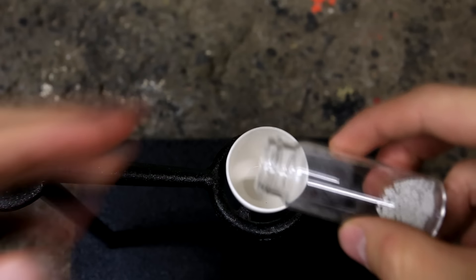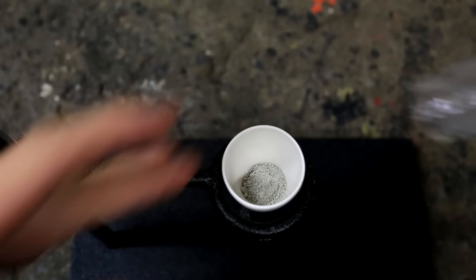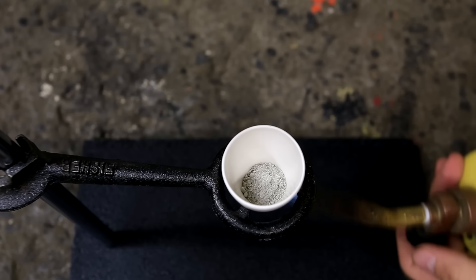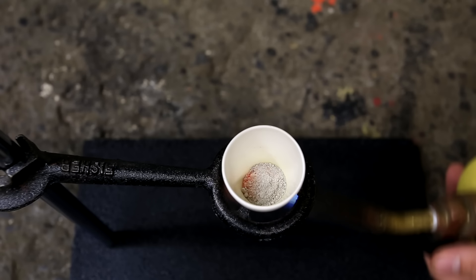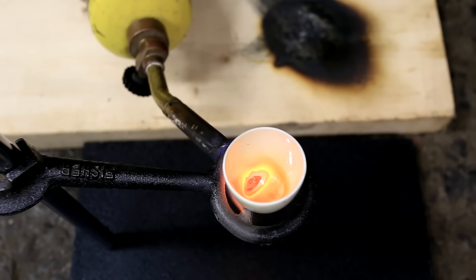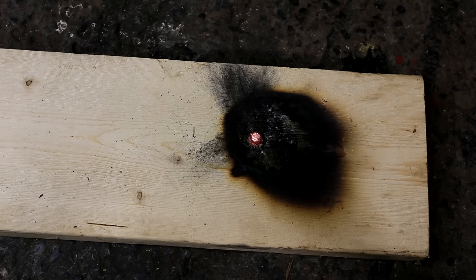Now to reconstitute the silver into the nice shiny metal that we normally see, we need to melt it down. The first step is to add it to a crucible. Then using a torch, the silver metal was liquified. It takes a little while for the silver to get up to its melting point, so you'll have to be a little bit patient. I turned the crucible around as I was melting it to form the silver into a large glob, then poured the red hot glob onto a piece of wood for it to cool down.